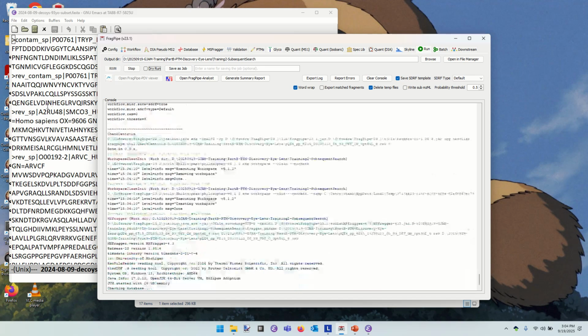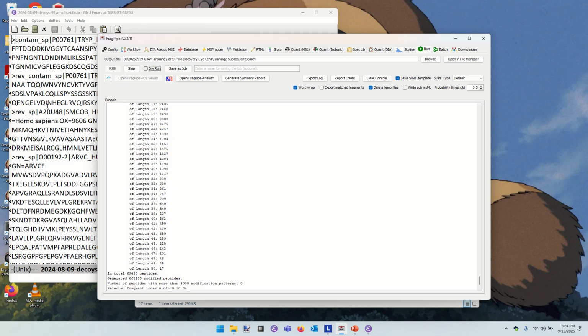Okay, so it could be very quick. It could be very long. What's long? What's too long? I don't know. In the old days, you would start your database search on Sequest on the single server when you left work, and you'd come in the next day, and hopefully everything would be done. Then we got a cluster because people started doing dozens of raw files at a time. These days, these searches can go really blisteringly quickly.